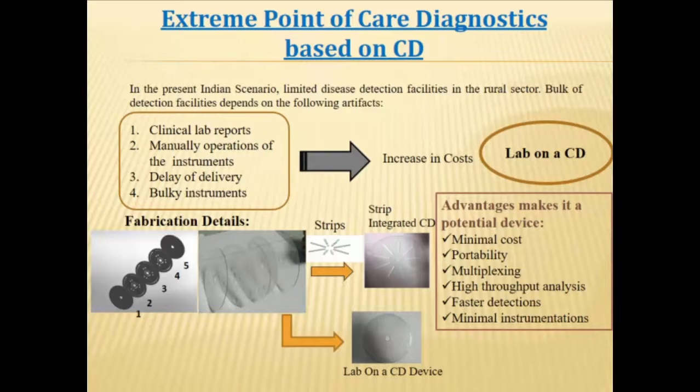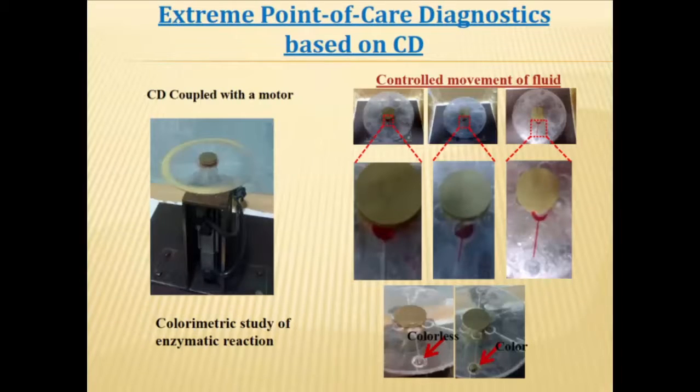So finally it will look like a compact CD where microfluidic channels and chambers are already fabricated. This is the motivation. You can use a stepper motor to rotate it, basically to use the centrifugal force to flow the fluid from one chamber to another chamber.